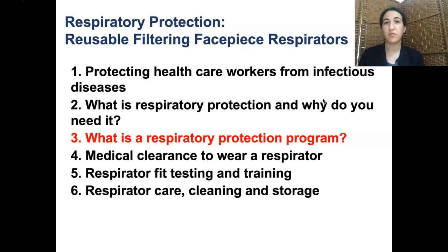In this section, we'll provide an overview of the components of a successful respiratory protection program. Note that specific elements of medical clearance, fit testing, and respirator cleaning will be covered in future modules. In particular, fit testing is complex, and we'll share videos in this module as well as in the fit testing module to give an understanding of what's involved. Some of the slides in this presentation are very detailed, and you are welcome to pause the recording at any time to review the slides in more depth.